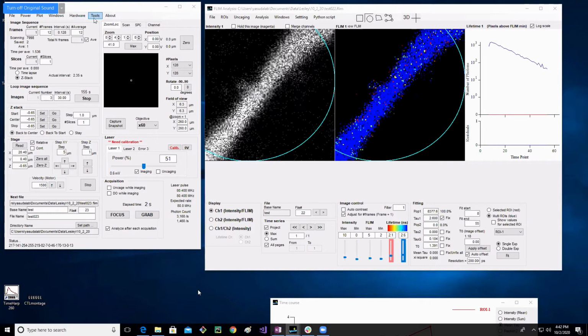We're going to talk today about the drift control. Also in the image sequence, once you create an image sequence, you can save that setting, so you don't have to do that sequence again and again. You can also load that sequence. And even without image sequencing, just saving your settings here, the software always opens up whatever your last settings were, which is super helpful.